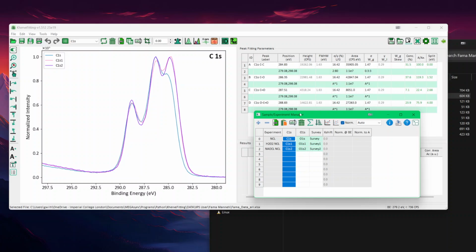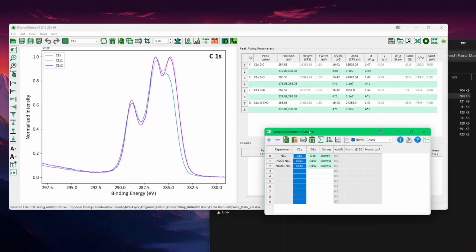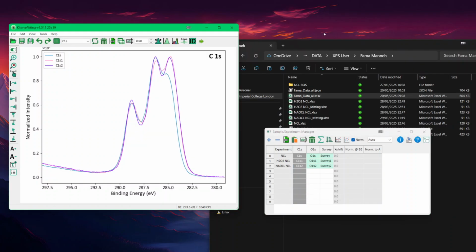the difference. And what you can do now also is add, for example, more pages in here using 2 instances of KherveFitting. So let's put that, you can see this arrow on the left, and if you put it down now, you have more space, let's say, to add a new instance. So I'm just going to add a new window.